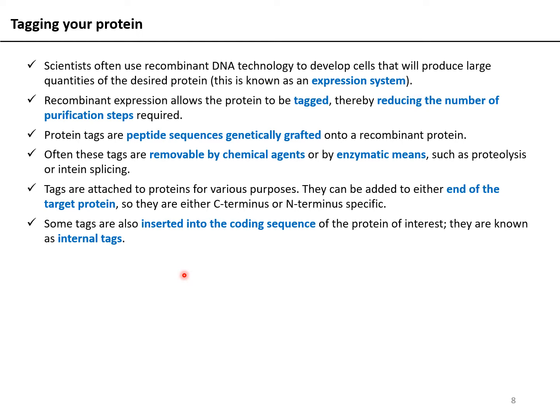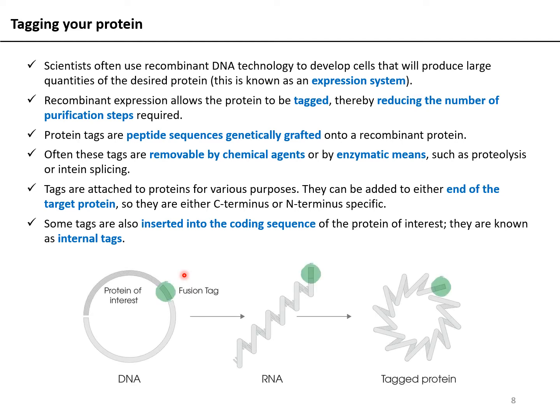If your tag is buried within the protein, it will not bind to its interacting counterpart on the affinity column, so it will be totally useless. So in order to introduce an internal tag, you should have an idea about the protein's folding. Therefore, most tags are either N-terminal or C-terminal. Internal tags are not really commonly used in protein purification.